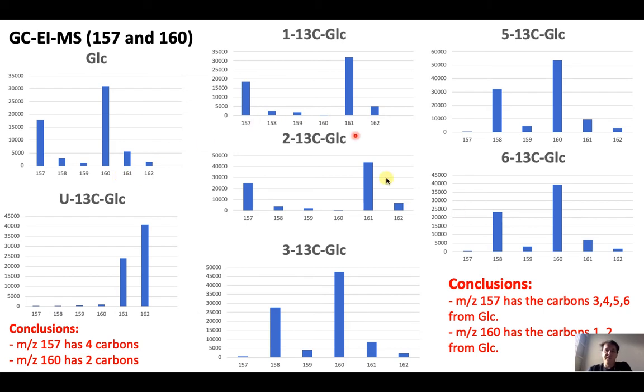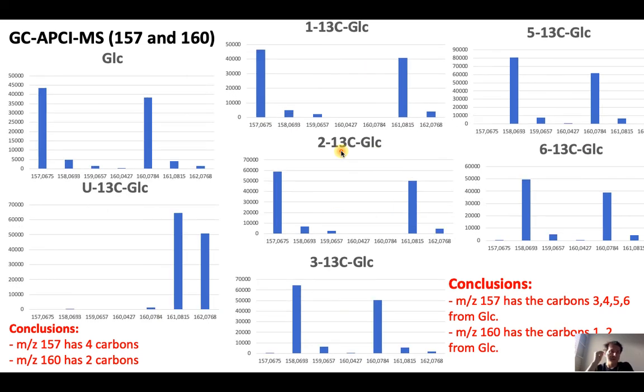We confirmed this by analyzing the positionally labeled glucose, by electron impact, and also by GC-APCI. So I'm pretty sure that they have these carbons.